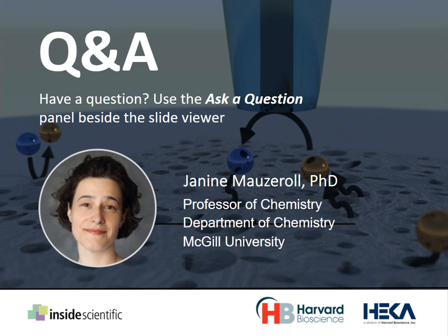Now, in terms of the oxidation state, usually ion selective electrodes are based on a principle like they'll use crown ethers or molecules that will capture the ion. I apologize, if the ion changes charge, it may need another molecule to capture it. And so, unless you can directly electrochemically react the ion at the microelectrode surface, you could plate it as well.